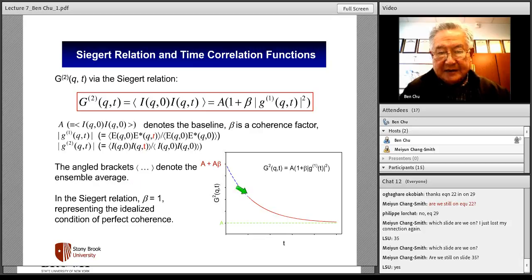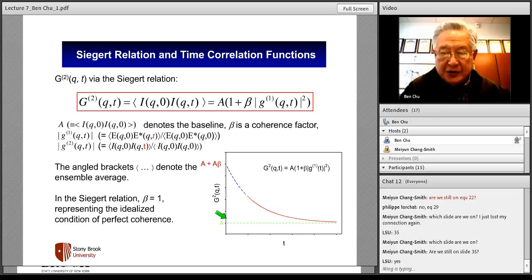In other words, we are not able to go all the way down there, and you have to do the extrapolation. You have to make measurements over long enough decay times so you know what the value of A is. Based on this, you can obtain the detailed information of the function. So experimentally, there are ranges that you need to choose in a proper way.